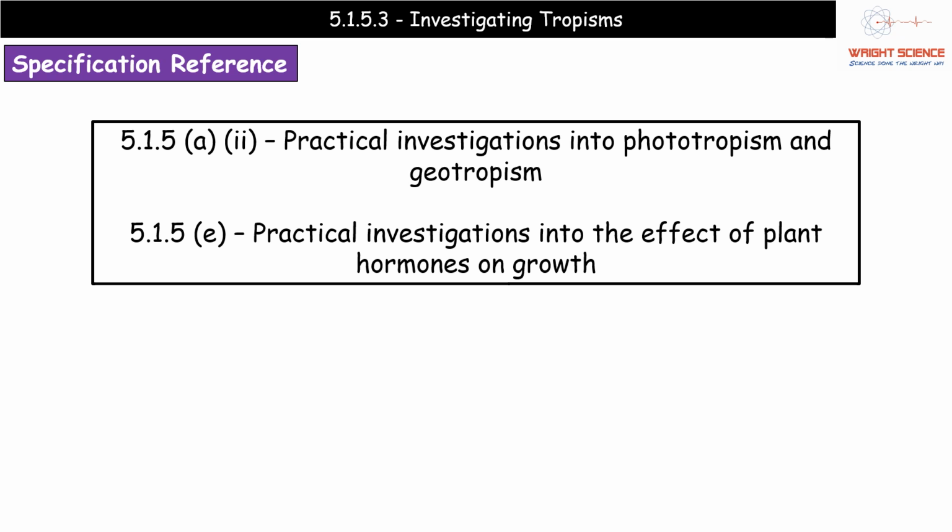Hey everyone, and welcome to our video on investigating tropisms. This is part of our Module 5 Part 5 series looking at those plant and animal responses, and what we're going to be doing in this video is having a look at specification reference 5.1.5a Part 2, Practical Investigations into Phototropism and Geotropism, and 5.1.5e, Practical Investigations into the Effect of Plant Hormones on Growth.